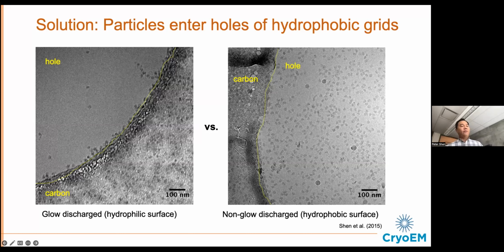So, I guess very low is all relative, right? One of the advantages with us working in budding yeast is that we can grow liters and liters of it without too much effort. I'll talk more about this ribosome complex that we're working on. Expression level is about 200 to 300 copies per cell, and typically with about 3 liters of cell growth, we have more than enough material to get good cryo-EM grids.